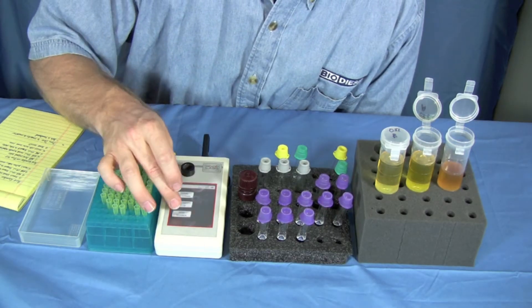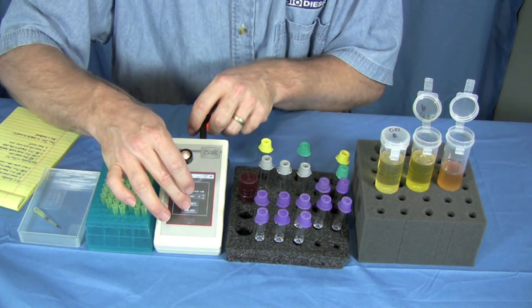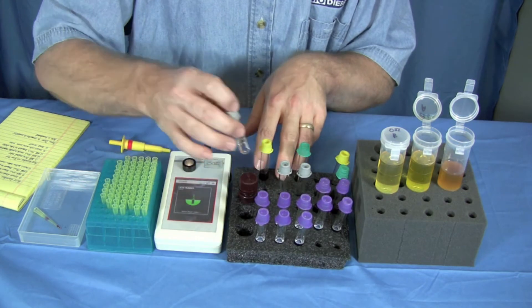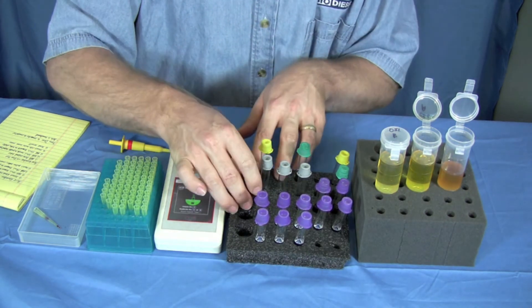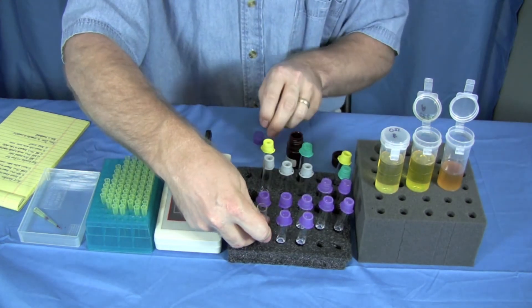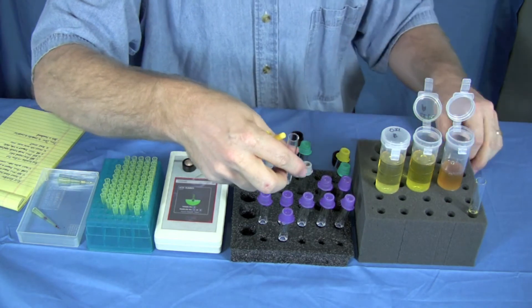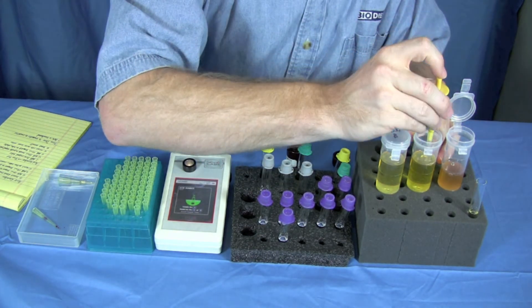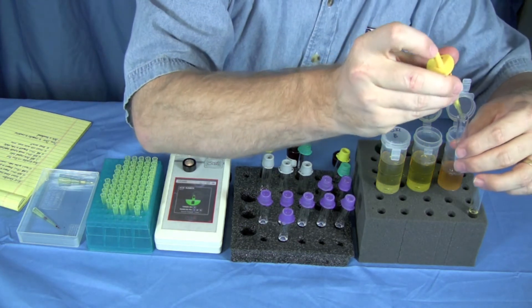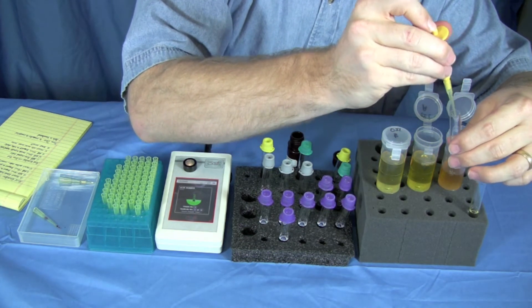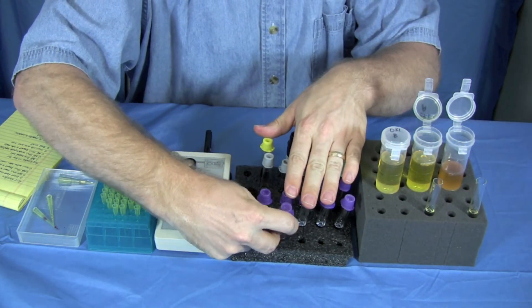To start this test we press the acid number button on the machine, push run test and we're going to put a blank in, pull the blank out, remove the tip. Use 150 microliters of this sample. Put that in and we'll prepare one more.